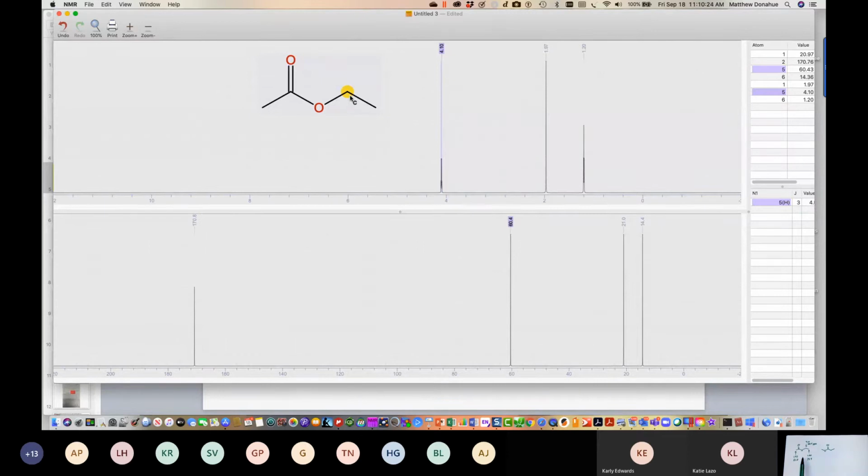What you can see, again on the doc cam, is that the chemical shift for proton lies between 0 and 10. For carbon, it lies between 0 and 220 ppm. What this means is that these functional groups occur in different regions of these spectra. Again, the sp2 hybridized carbon occurs at 170.